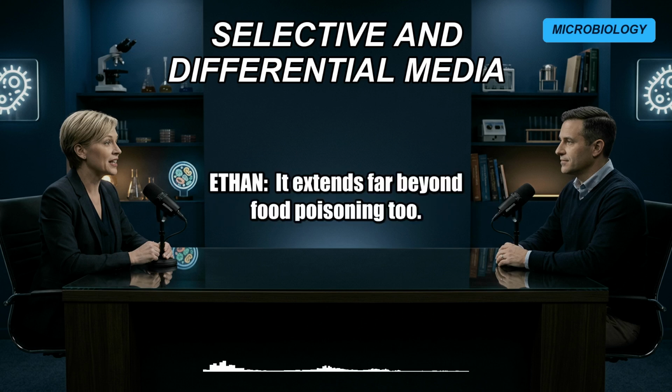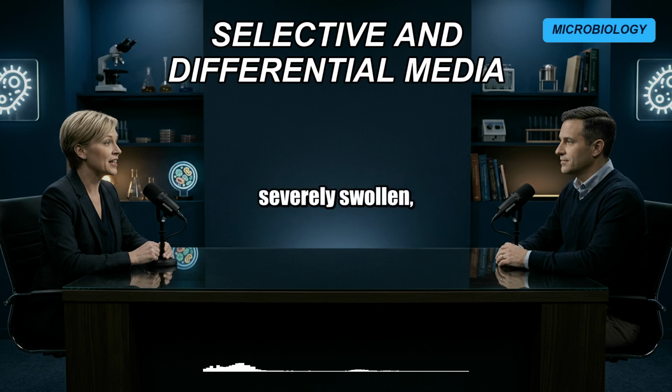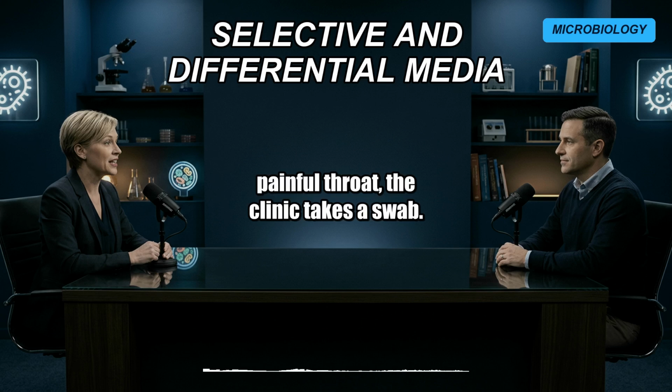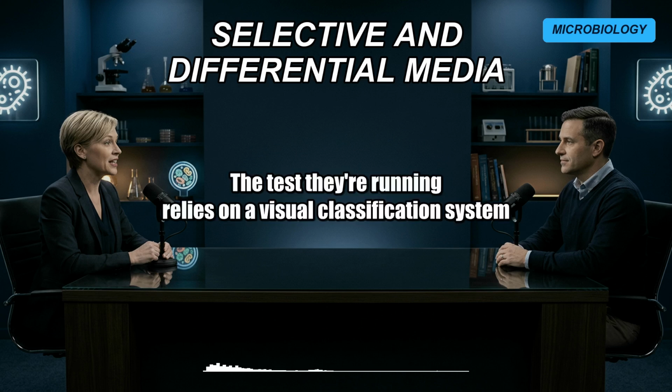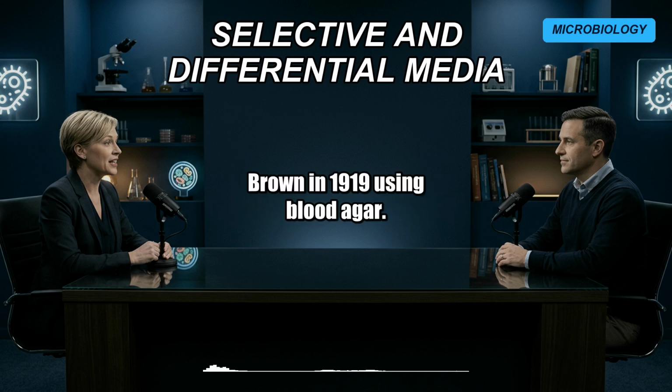It extends far beyond food poisoning, too. If you walk into an urgent care today with a severely swollen, painful throat, the clinic takes a swab. The test they're running relies on a visual classification system published by J.H. Brown in 1919 using blood agar.